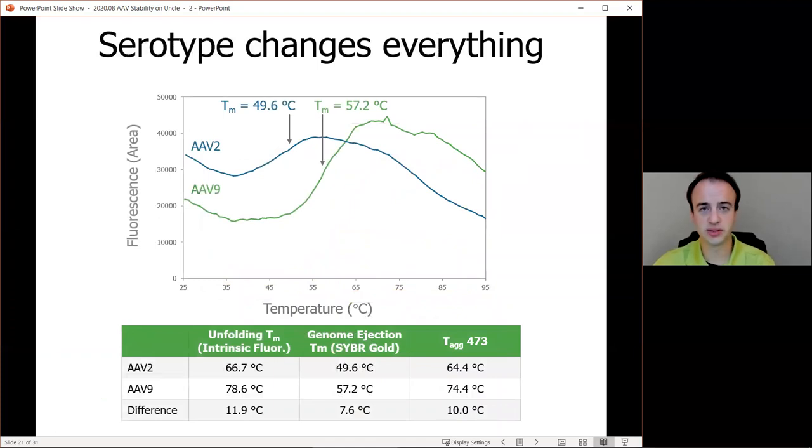And serotype also changes everything with genome ejection behavior. In this case, we're comparing AAV9 that we've seen to AAV2. And we're seeing an 8-degree shift in melting temperature behavior with AAV2 having an onset temperature of about 37 degrees Celsius. So at the bottom, I've also put the temperatures from the unfolding melting temperature from the intrinsic fluorescence, the genome ejection temperature shown in the graph, and the aggregation temperature using the blue laser. And you can see that the difference between the two serotypes is not a consistent value, so we can't just measure one of these and extrapolate. We have to actually measure each of these different behaviors to fully characterize our capsids.